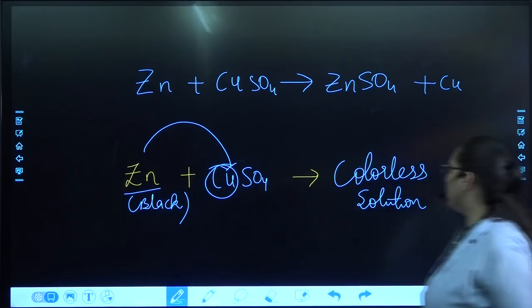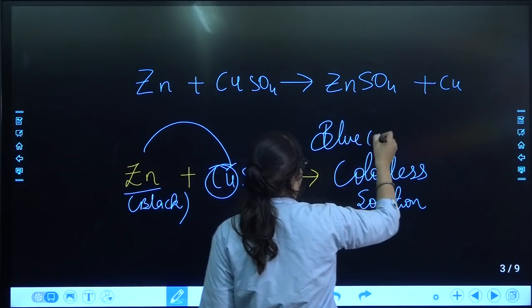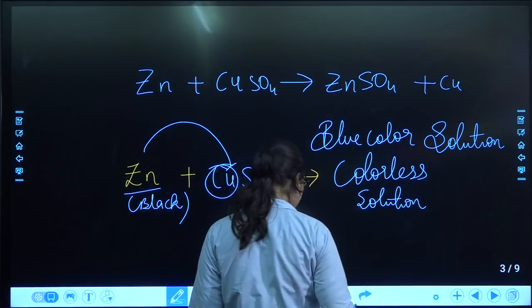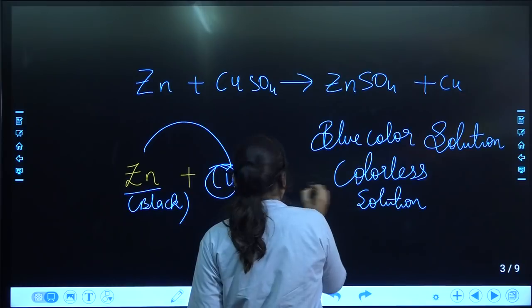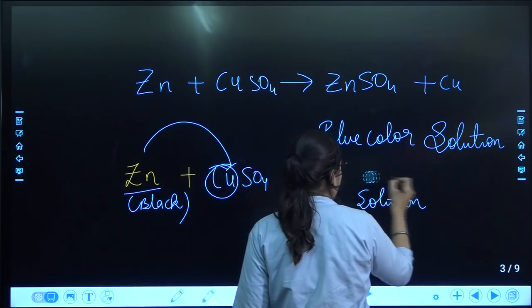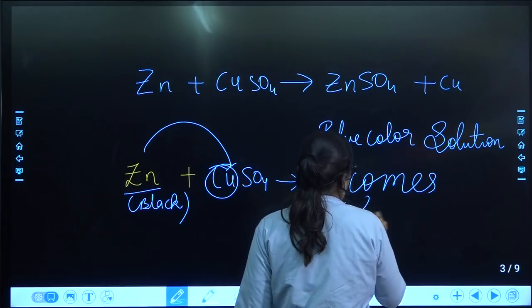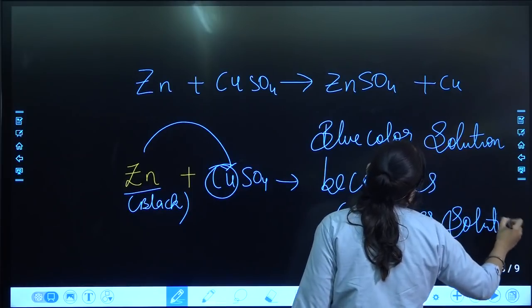Here the blue color solution becomes colorless.